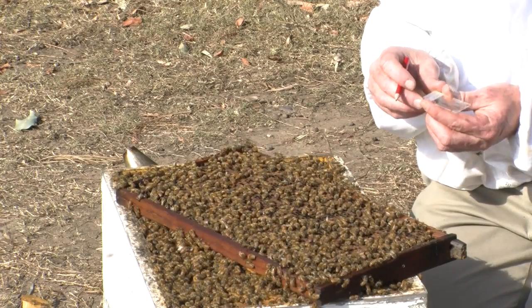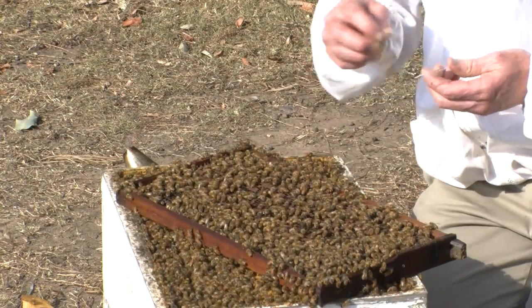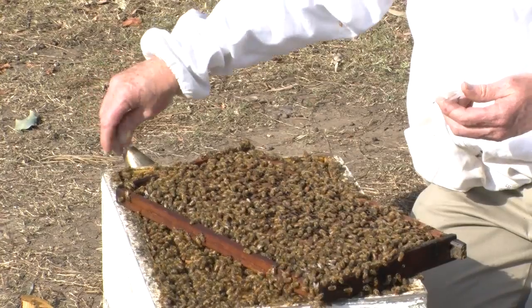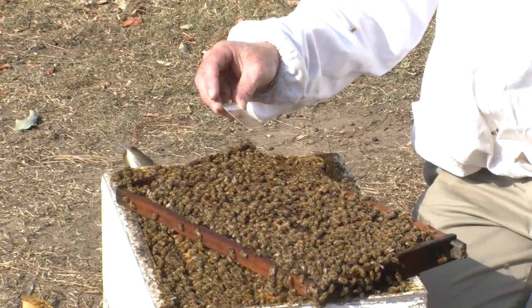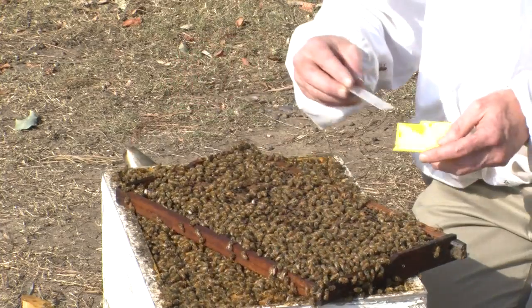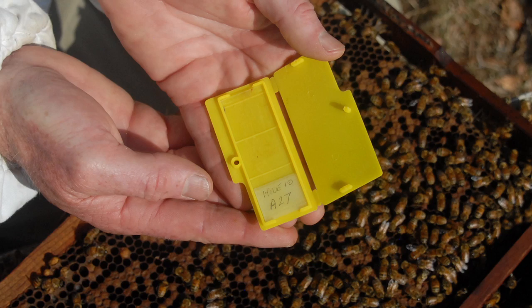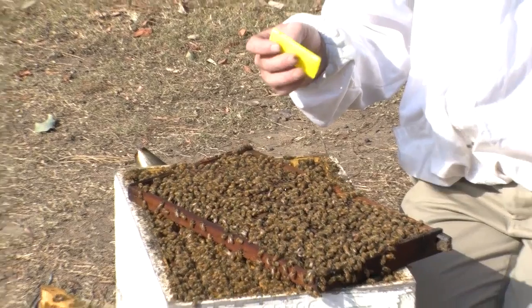So when this particular slide goes to the lab, if it does get mixed up then it will have the registration number. That's nearly dry — close enough. We'll just put that in a slide protector like such, and it's ready to post to the lab with the details in the notes.